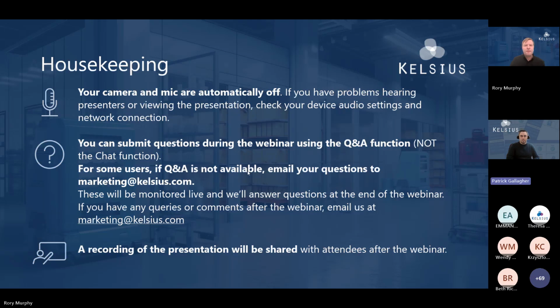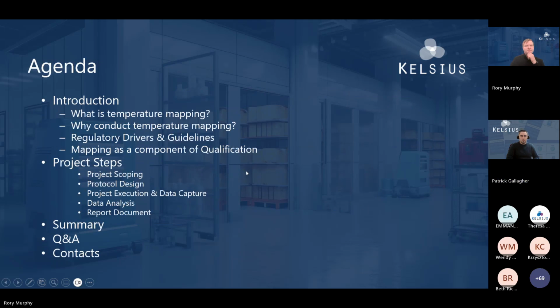Next slide there, Rory, please. So for today's webinar, you'll see an agenda on screen. We're going to cover an introduction, what is temperature mapping, why conduct it, the regulatory drivers and guidelines, and mapping as a component of qualification.